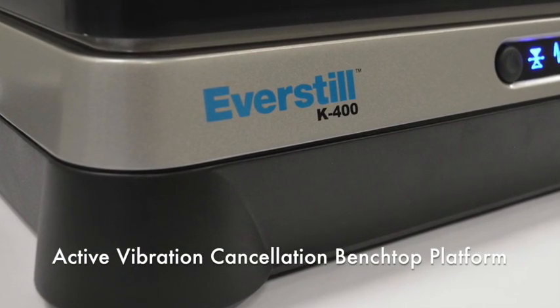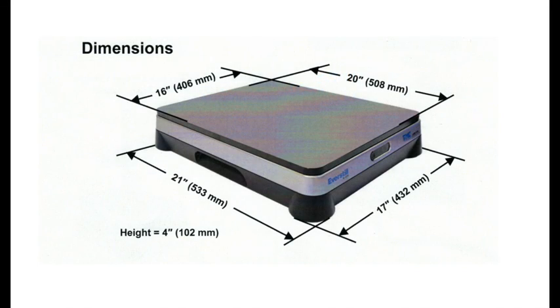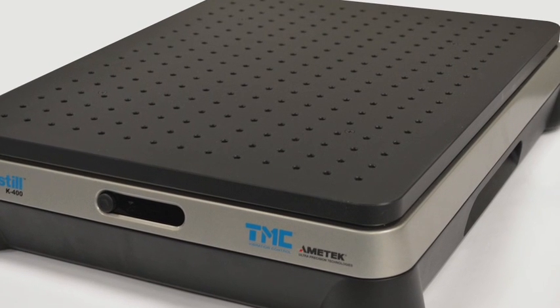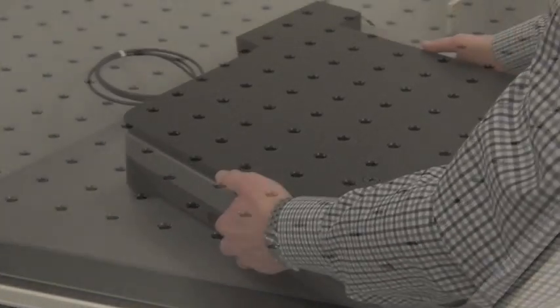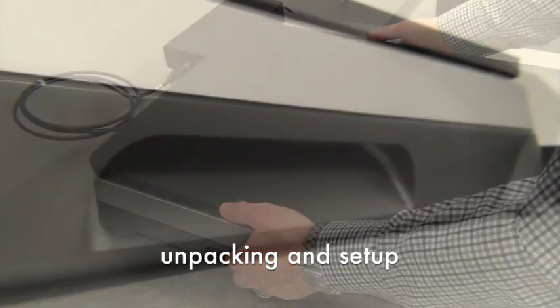The Everstill K400 is 16 by 20 inches to fit different types of small yet sensitive precision instruments. In addition to a solid top plate, a top with a tapped hole array — either 1/4 by 20 on 1-inch centers or M6 on 25-millimeter centers — is also available. The unit is designed with built-in handholds, allowing for easy unpacking and setup.